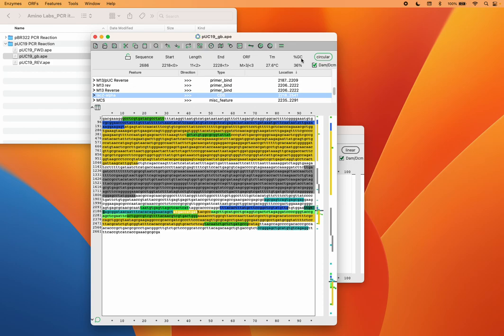It still should work. But beyond that, it becomes difficult for the companies that you send the sequences to actually synthesize your DNA. Okay, so ideally you want to design for in between 45 and 55 and have 40 and 60 kind of as the outer limit of what's possible. Okay, so I'm just going to go through and let's watch those values as I select more and more. And again, we're trying to get to a TM of about 60 and a GC of around 50.